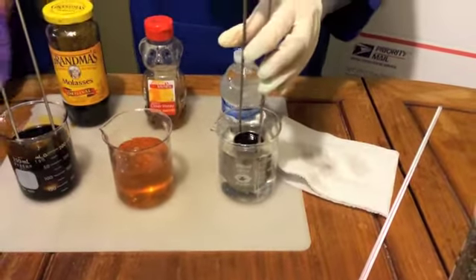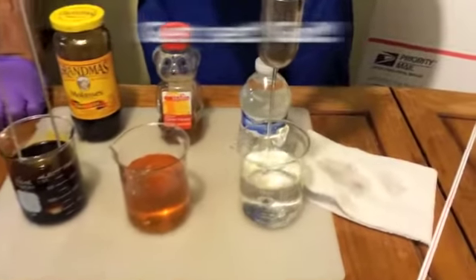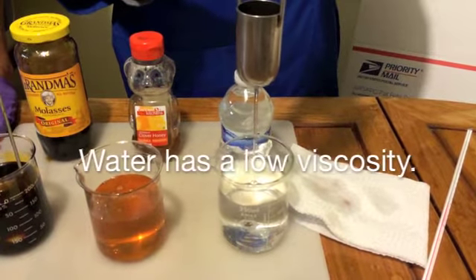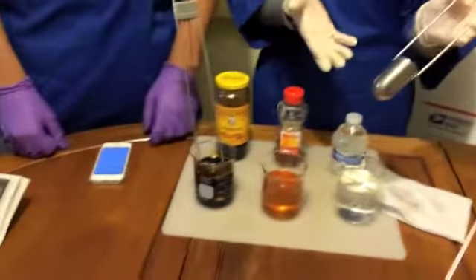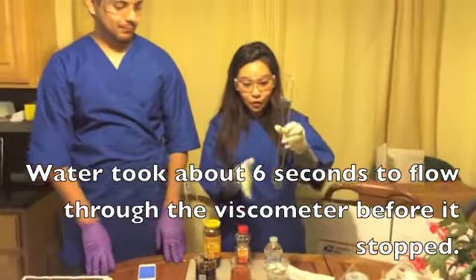So Chris, are you ready? I'm ready. All right, get set, go. So water flows really fast, and it stops now. So it breaks now. It only took about 5.9 seconds for water to flow through the viscometer.